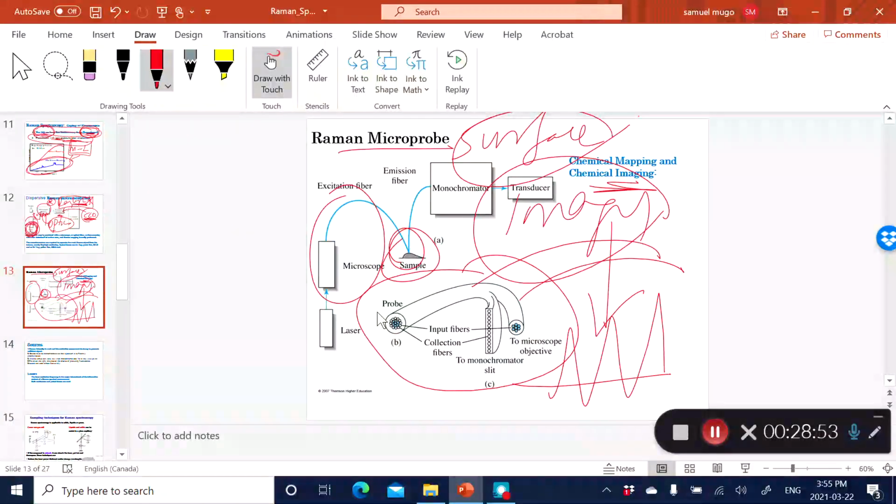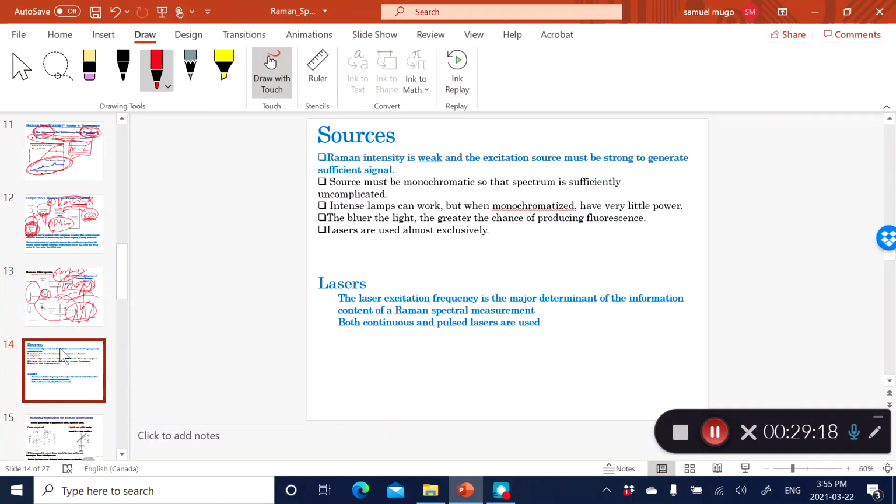And so very useful, as you're going to see later on, when you're trying to analyze the surface of probably a material such as a nanomaterial, a carbon fiber, a textile, and so on. So you can actually get the chemical image, how the image looks like, as well as get the spectra. And that way you can get lots of good information.